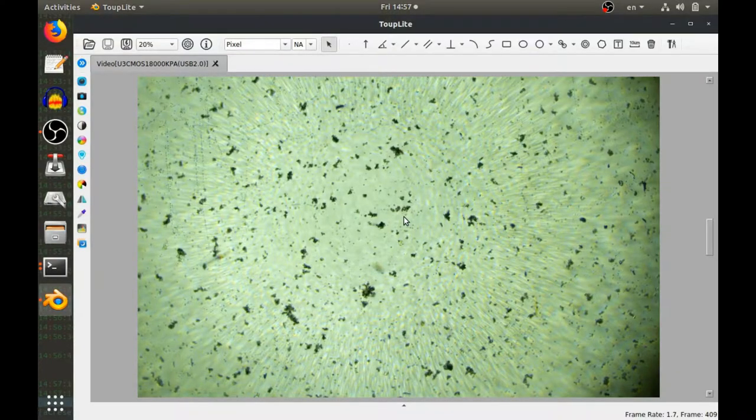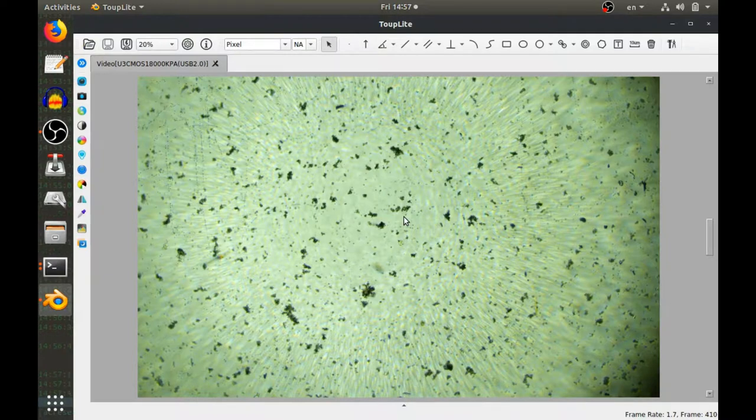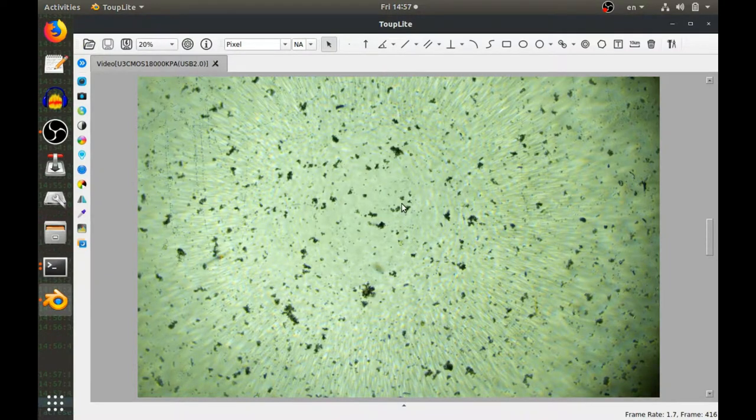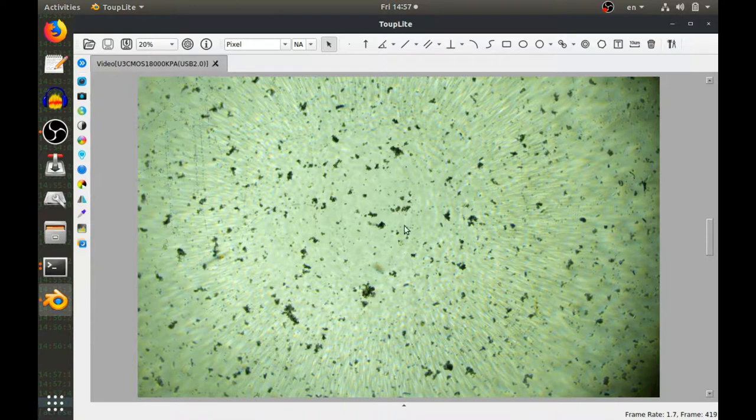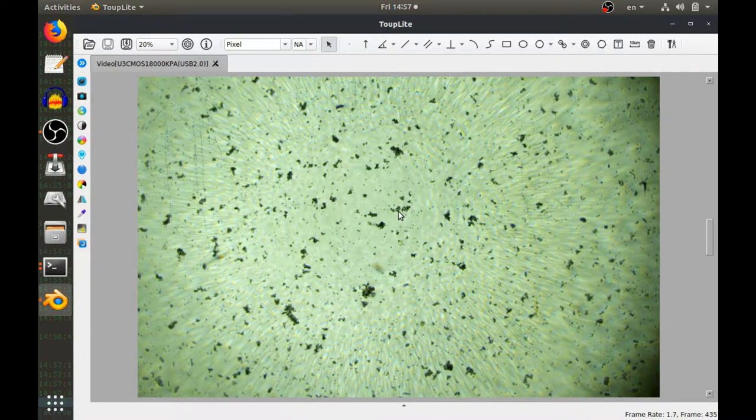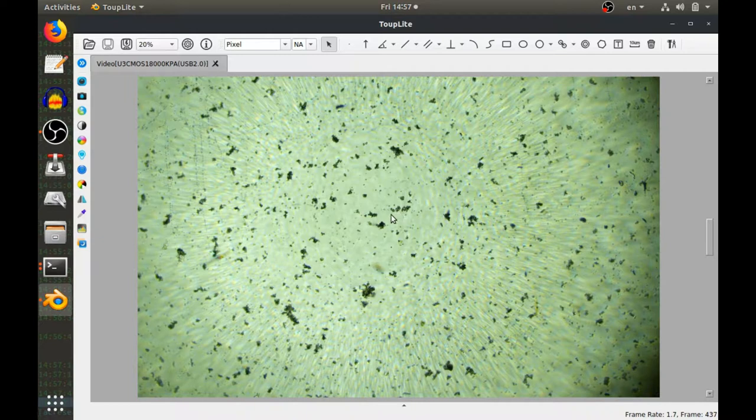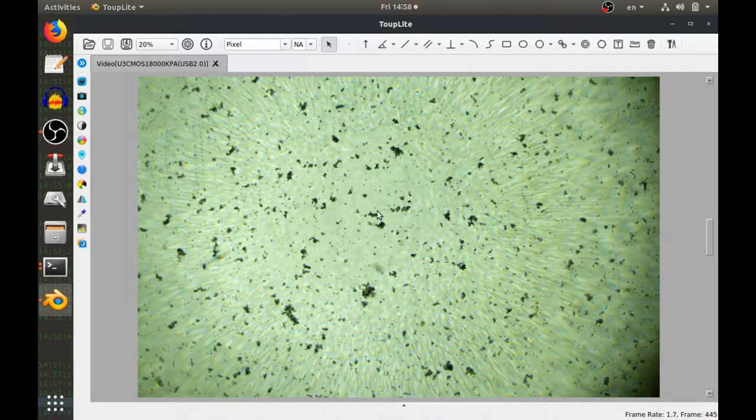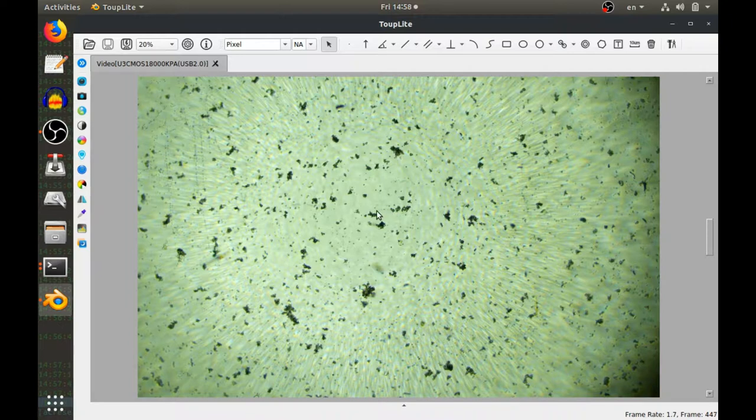It's a very low magnification, 40 times only, and you can see here are the cells. It's a little bit tricky to focus because there is a delay. So when I try to change the focus, there is like a one or two second delay, and it makes it very difficult, a little bit challenging to get it sharp.